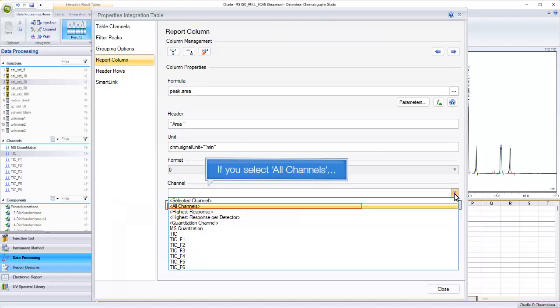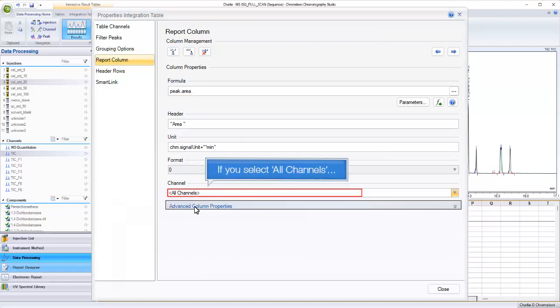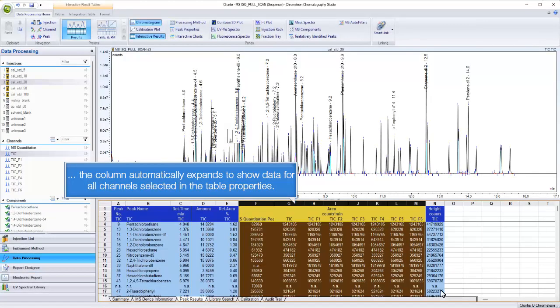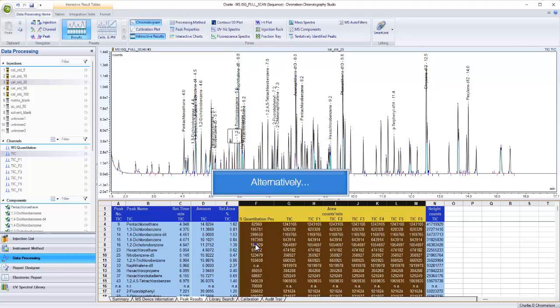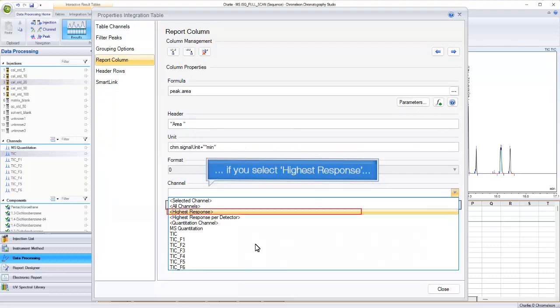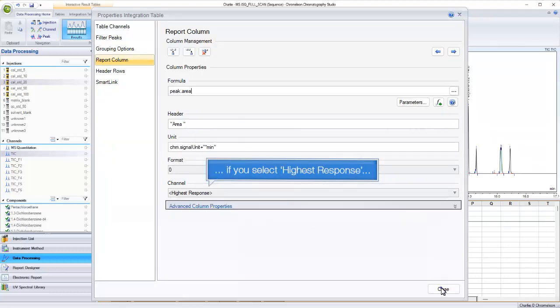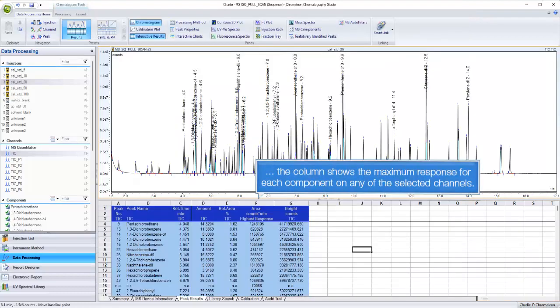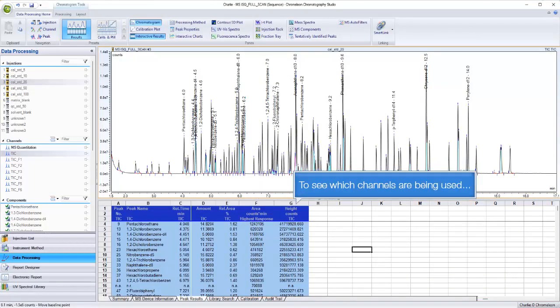If you select all channels, the column automatically expands to show data for all channels selected in the table properties. Alternatively, if you select highest response, the column shows the maximum response for each component on any of the selected channels.